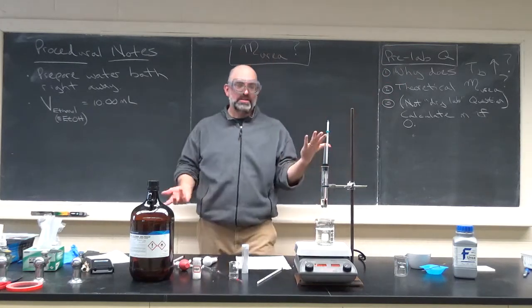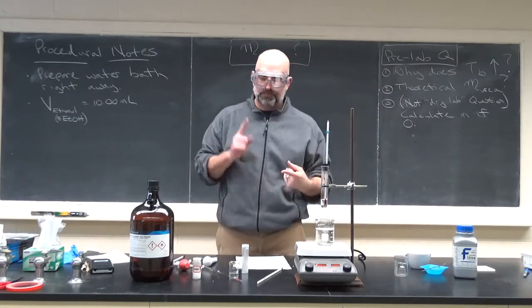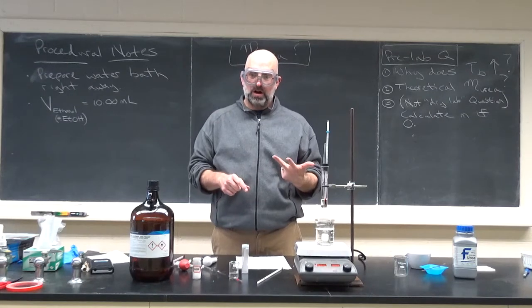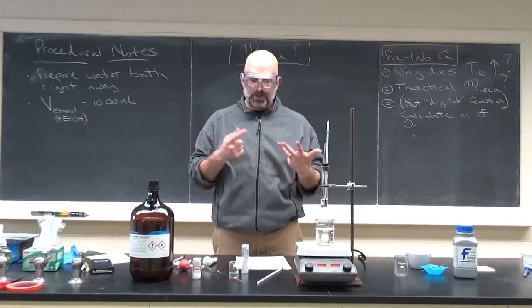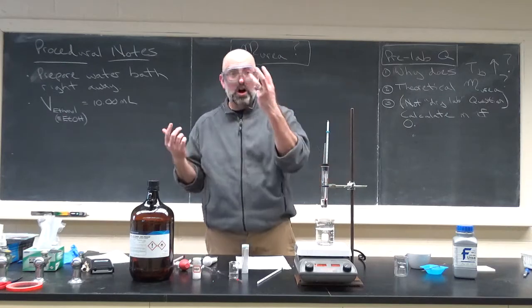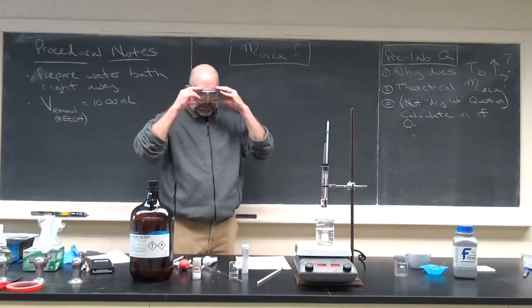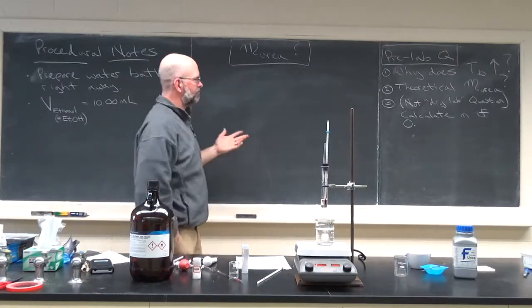So all the data you're getting is, let's see, you're getting the mass of urea, the boiling point of pure ethanol, which should be about 78.5, and the boiling point of ethanol with about a gram of urea dissolved in it. I think that's all the data you're getting, just all that work for 3 data points. Okay, let's talk about the pre-lab questions. So some things I want you to do.